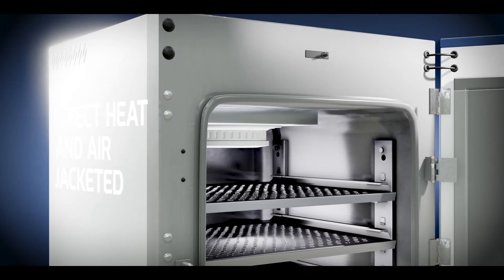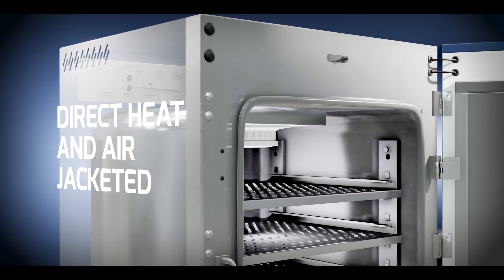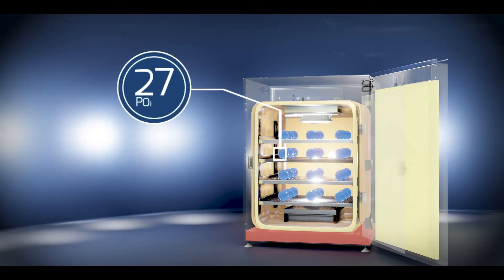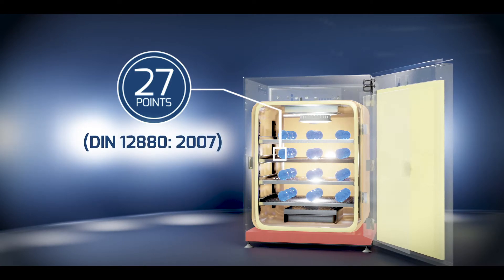The direct heat and air-jacketed design of the CO2 incubator allows even distribution of heat with less than plus or minus 0.35 degrees Celsius temperature variation at 27 points in the chamber, following DIN 12880-2007 testing standards.